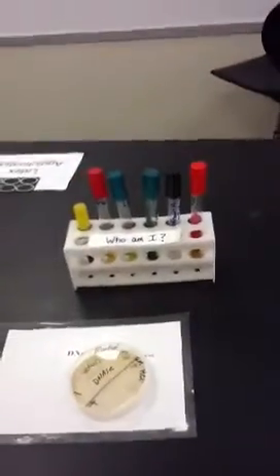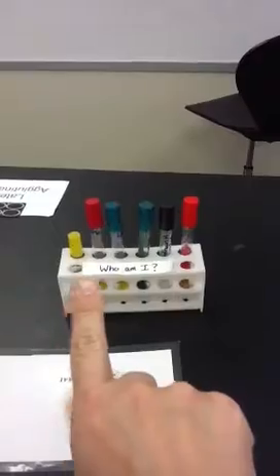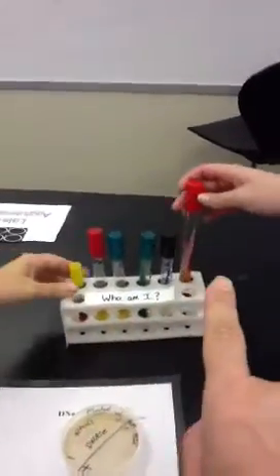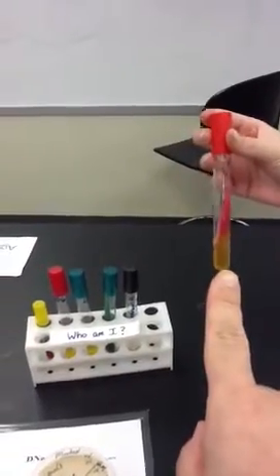Okay, so they might give us a chart and tell us these... here are the different tests. Yeah, I'm... And what am I? With an unknown table. Right, you have to know what these results mean. So that's a Ka result.